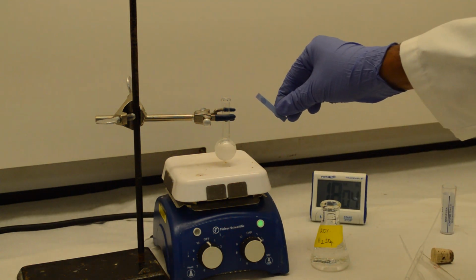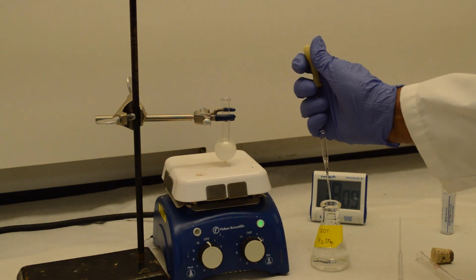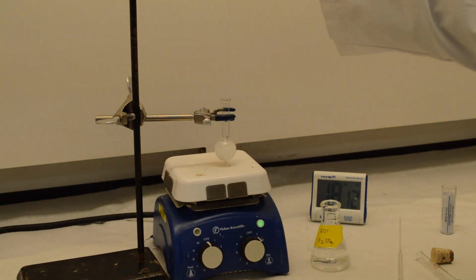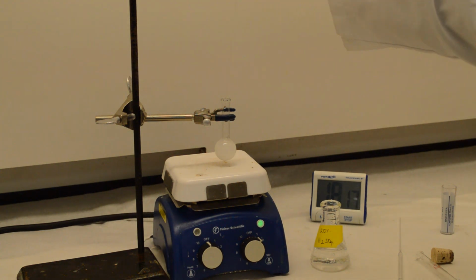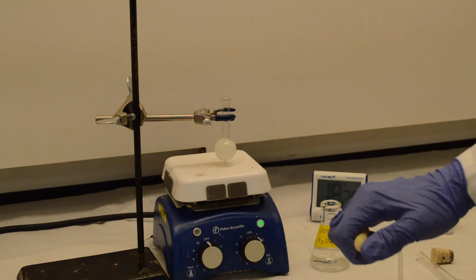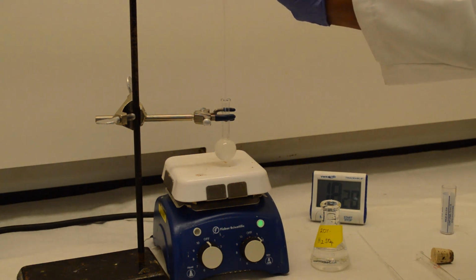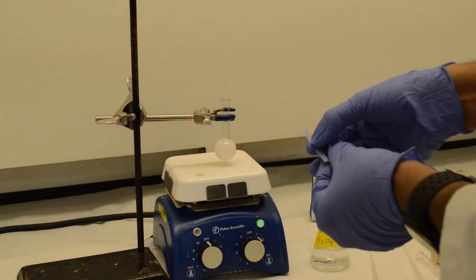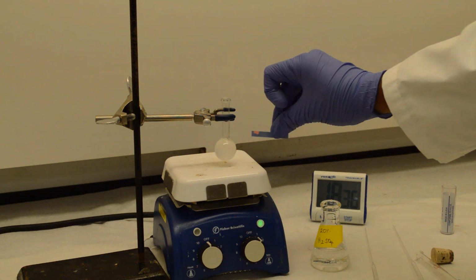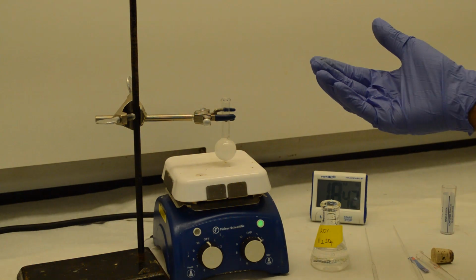We need more sulfuric acid. Okay, now this is acidic, right? Which means you have enough protons to protonate the sodium benzoate into benzoic acid.